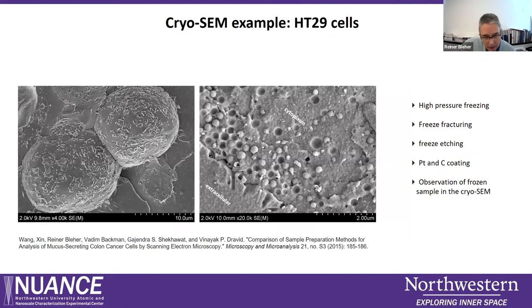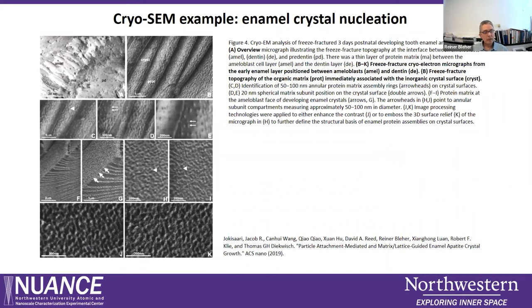The next sample is a human colon cancer cell. On the left, the fracture plane went across the whole cell so we are looking at the outside of the cell membrane, with some areas where the fracture went through the cytoplasm. On the right, we can see mucus-containing vesicles that store the mucus excreted by these cells, the cytoplasm interior, a profile of microvilli, and the extracellular space. This was high pressure frozen, slightly etched, coated, and observed in cryo-SEM.